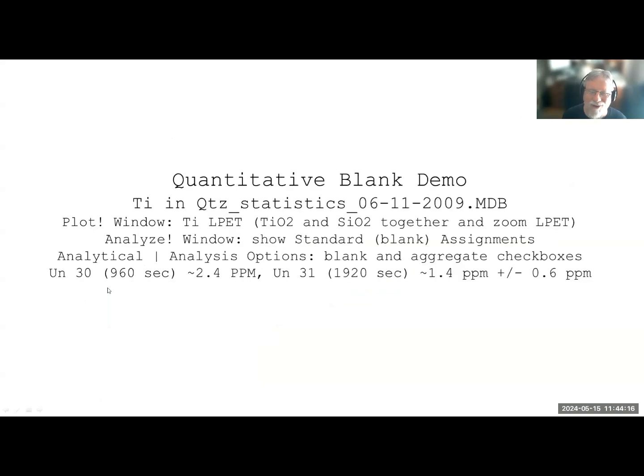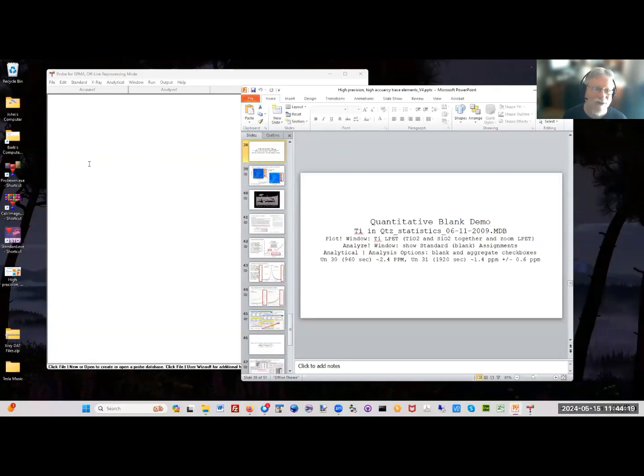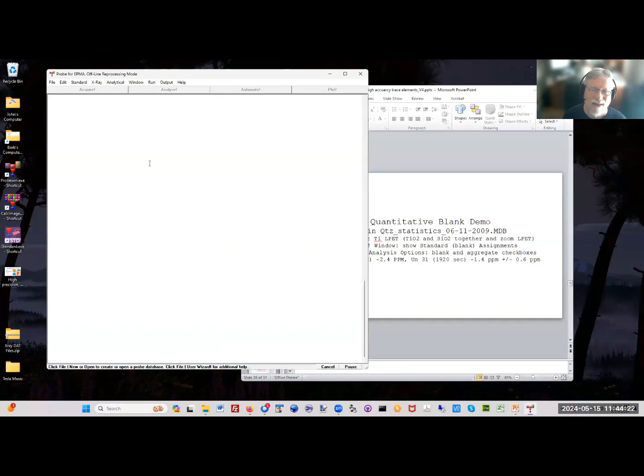I really want to show this. I'm going to beg for your indulgence and show you really quickly something kind of cool.